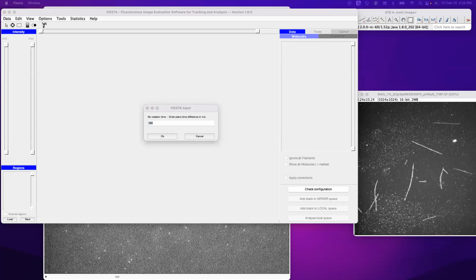We don't need to add anything to the exposure time. Talking about this time difference, is this usually 1.2? Yeah, I think that's what I use too. We add two things. One is pixel and one is time. It specifies the time and pixel size.